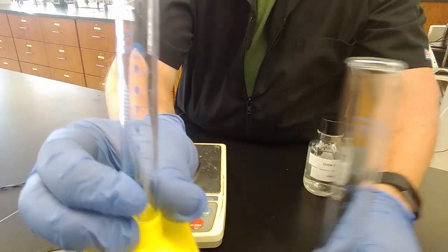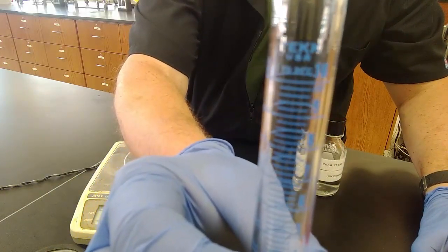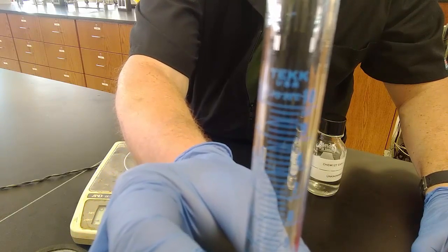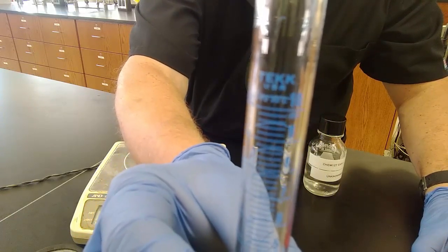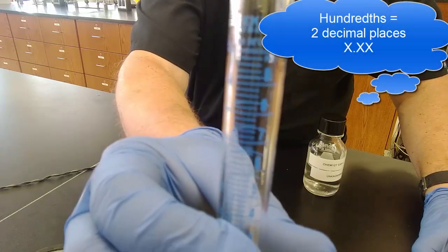We guessed by how much. This one, we can see that it's going to be between the, let's say, 9.8 and 10.0 line. And so we have to guess the hundredths place.